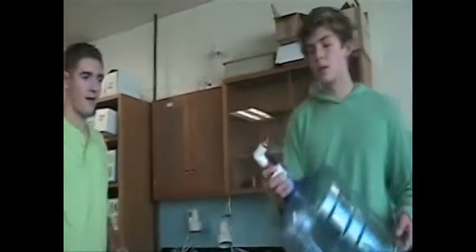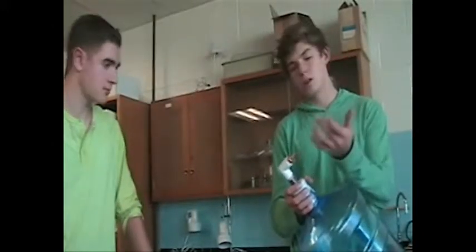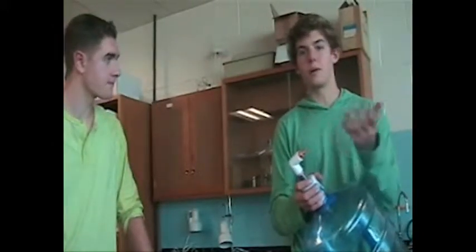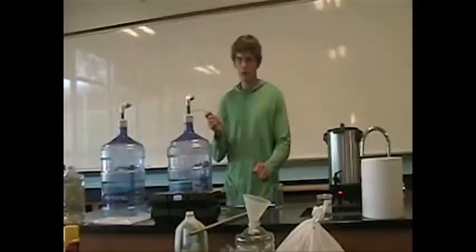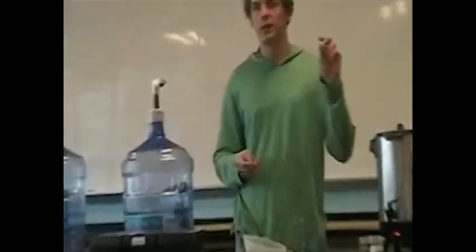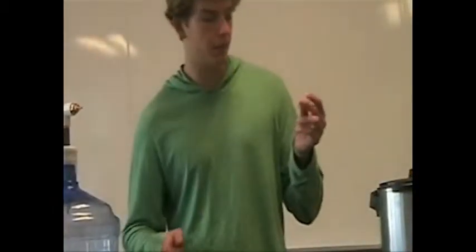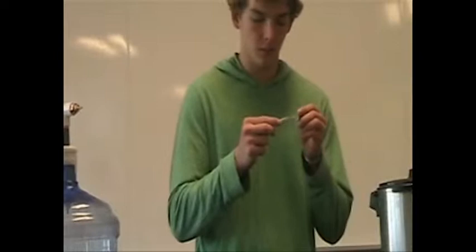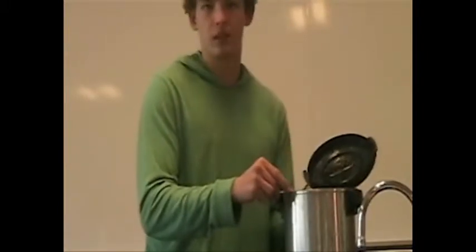Well, now we've got that on. We can connect the hose to this, and then to a check valve, a one-way valve, so we don't have any backflow, and attach it to the air pump. Here we got some nice tubing, and then we got the check valve. This is going to allow no backflow from this back to the air pump. And to get this on here, it's kind of a tight fit, so we're going to use this hot water to make this expand. Let it sit in there for a while.